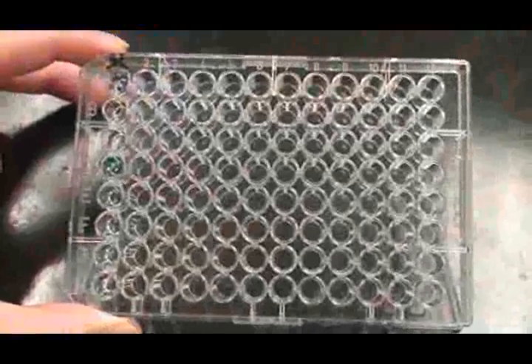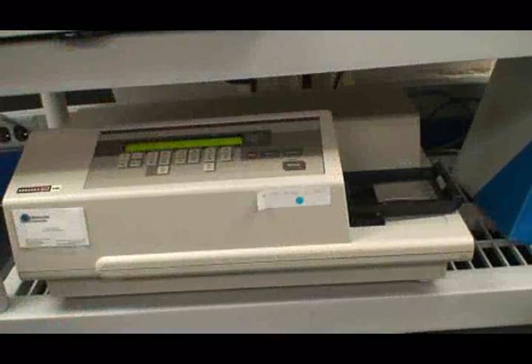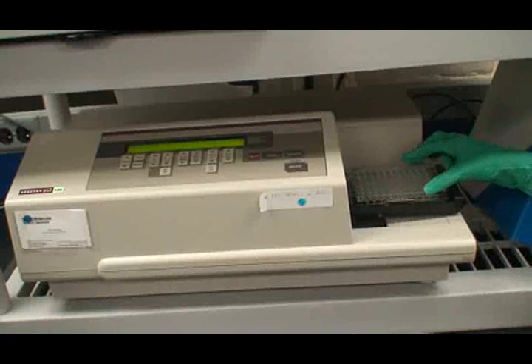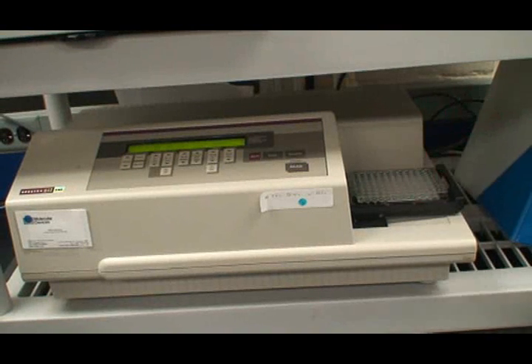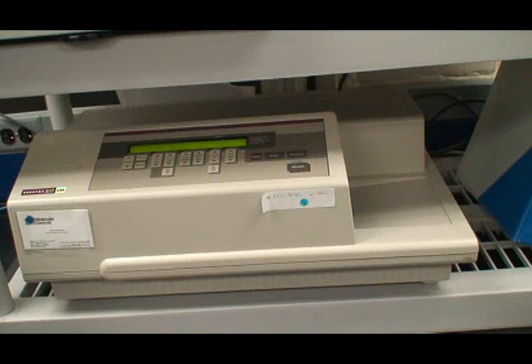Determine the amount of color formation in each well qualitatively by observing it visually. Set the wavelength on the plate reader to scan at 450 nanometers and ensure the printer is turned on. Press the drawer button to open the drawer. Place your plate in the drawer and press the button again. Press read to start the instrument.